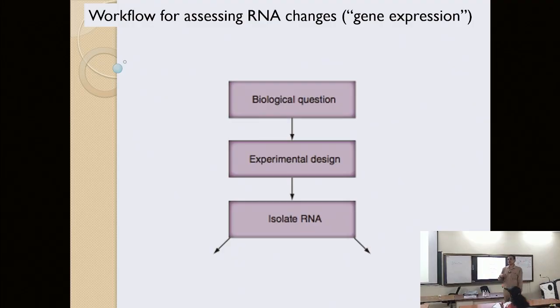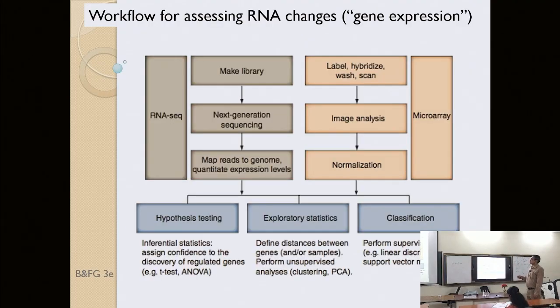Okay, so RNA will be isolated from me as well as a healthy individual, or multiple healthy individuals. So then here are the steps for RNA-seq. Once RNAs are extracted, an RNA library is made. I will show you this again in a moment.